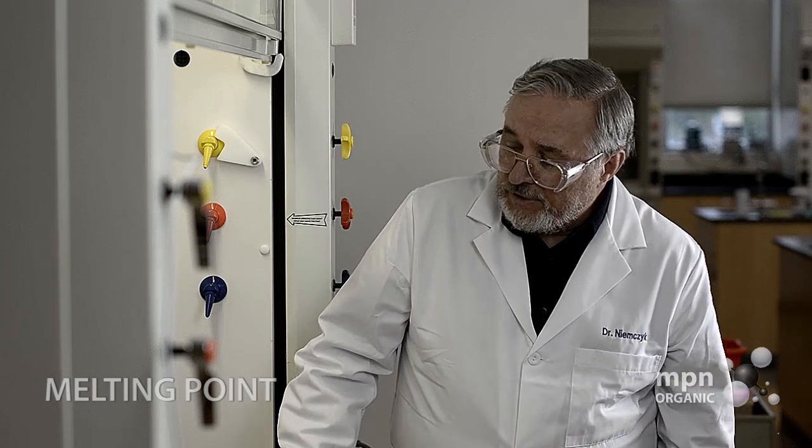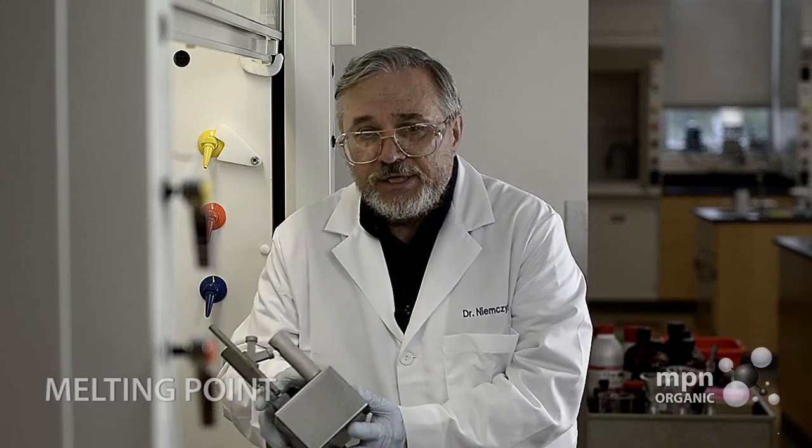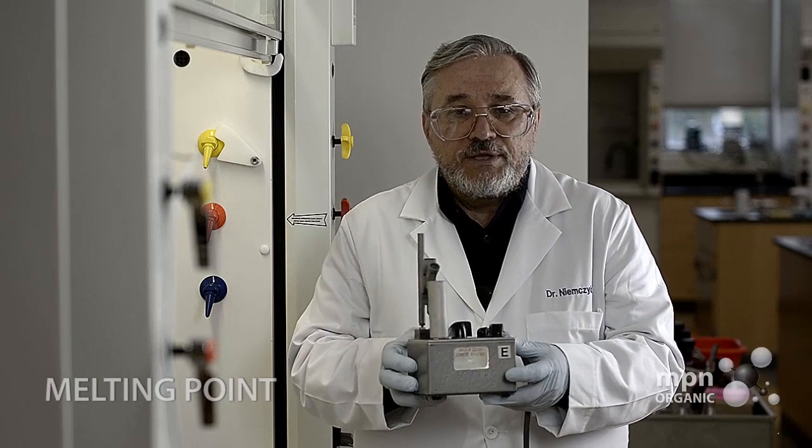The first experiment that you're going to do in the organic lab this semester is the taking of a melting point of two pure materials and the various mixtures of them. And the device that we're going to use is what we call the Mel-Temp.